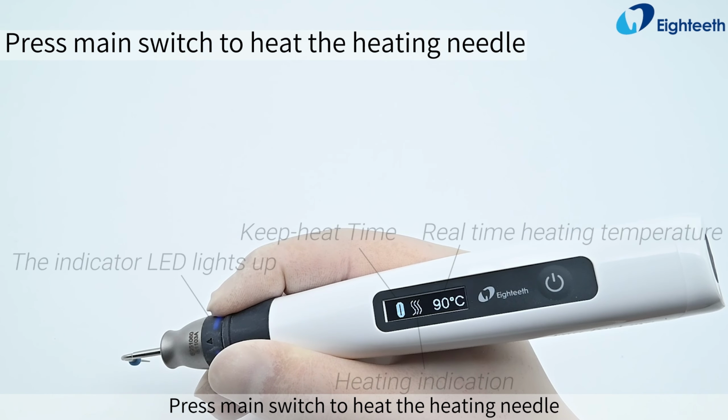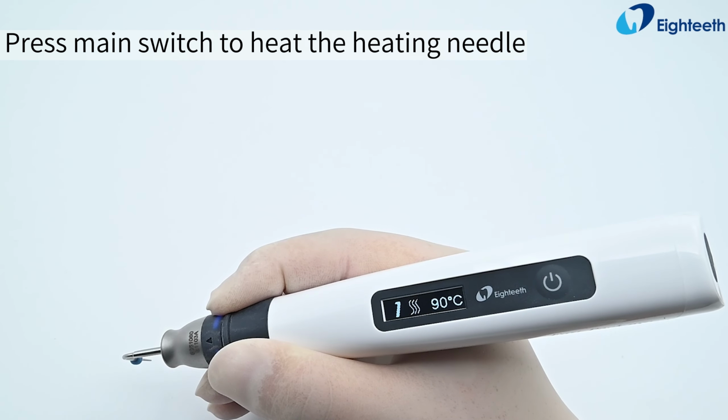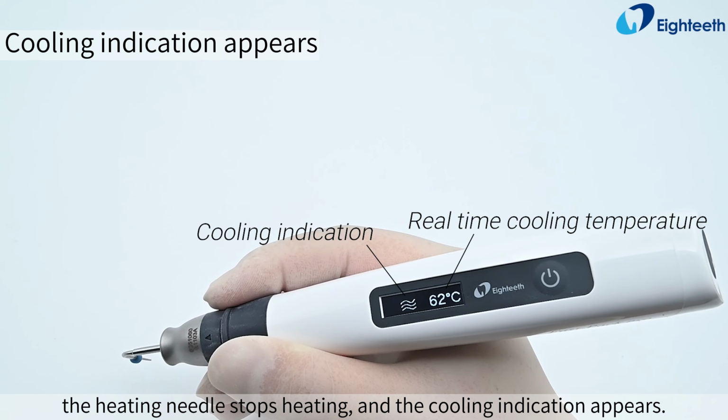Press main switch to heat the heating needle and various parameters will be displayed on the screen. Release the main switch, the heating needle stops heating, and the cooling indication appears.